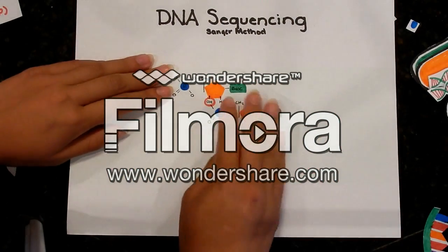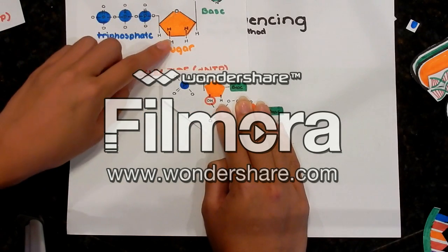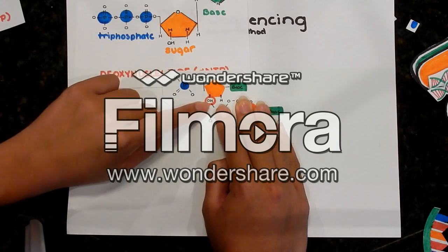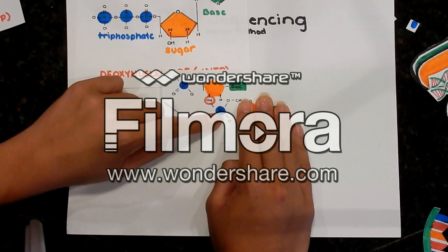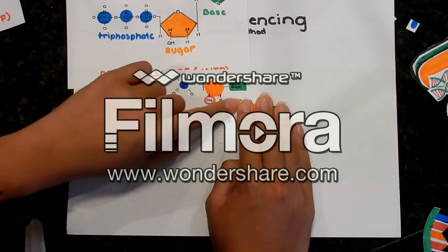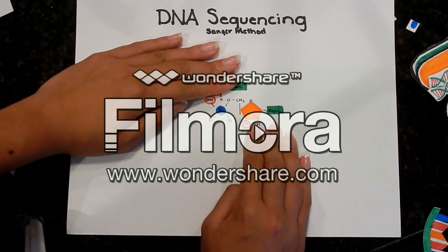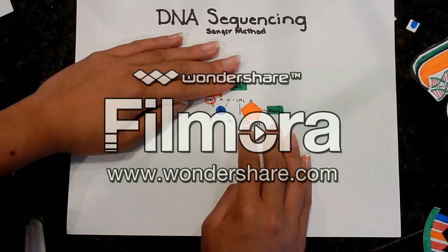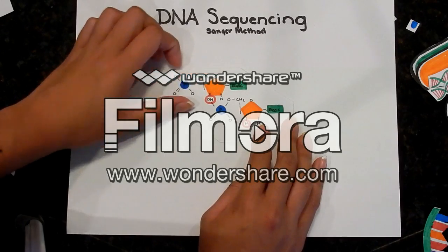So here, I'll give you an example. As you can see, this is a normal deoxynucleotide because it has a hydroxyl group. And here, the hydroxyl group has an oxygen atom where the phosphate group of the next nucleotide can attach itself and continue the chain. However, if the next nucleotide has a hydrogen atom, it doesn't have that necessary oxygen atom, so the phosphate can't attach itself. Therefore, it's stopping the chain of DNA.